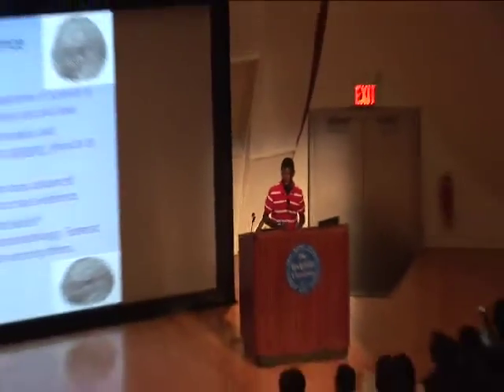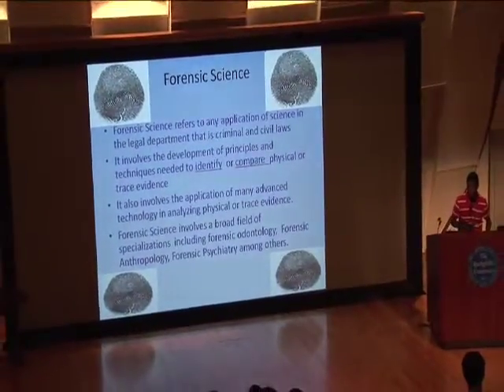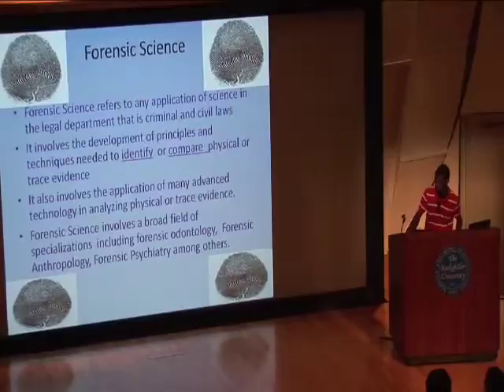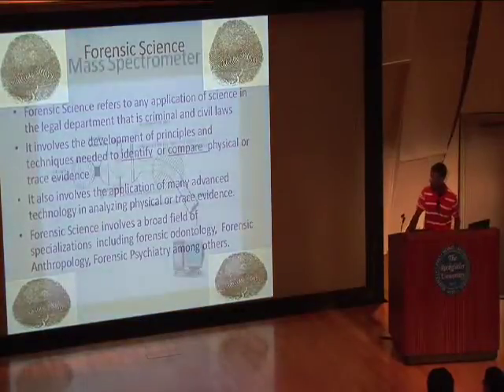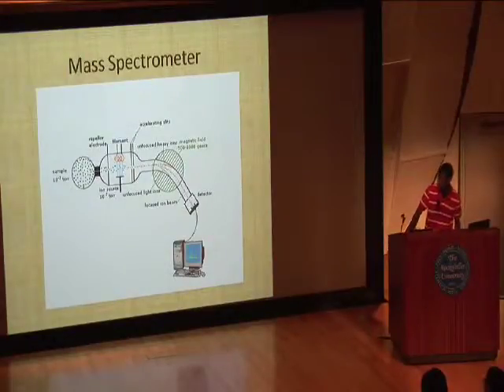It was developed in the 18th century when people started investigating crimes by comparing evidence and gathering a large database of methods and other evidence. I'll be reviewing one of the methods, called mass spectrometry. It's also been applied in other fields like physics and chemistry.